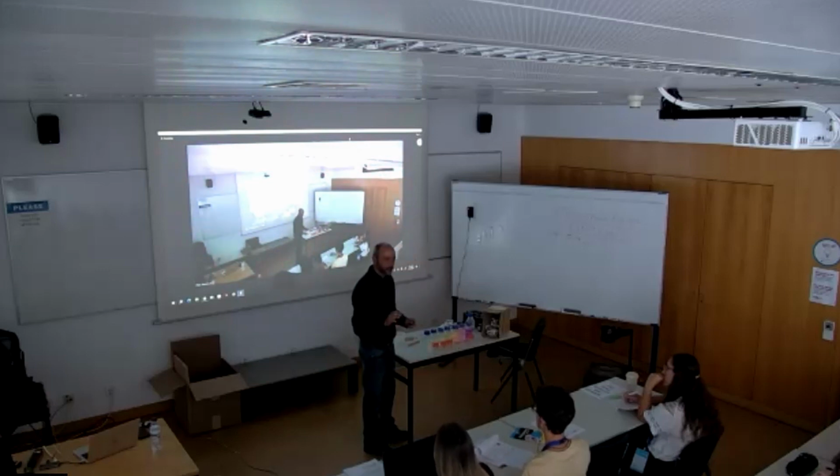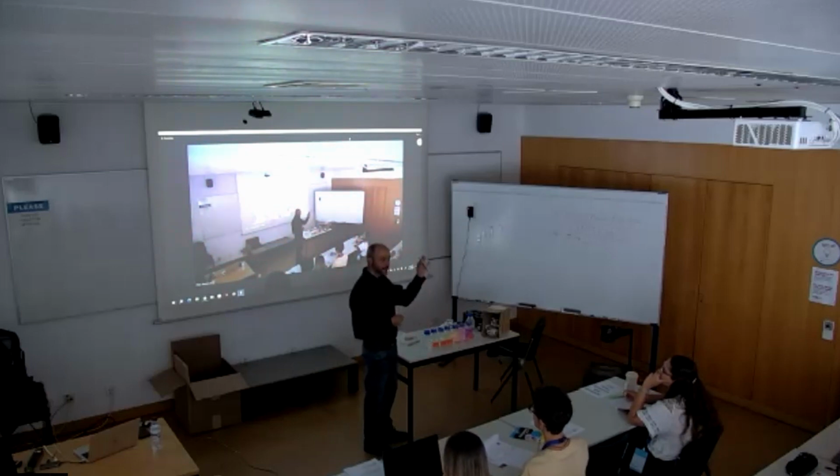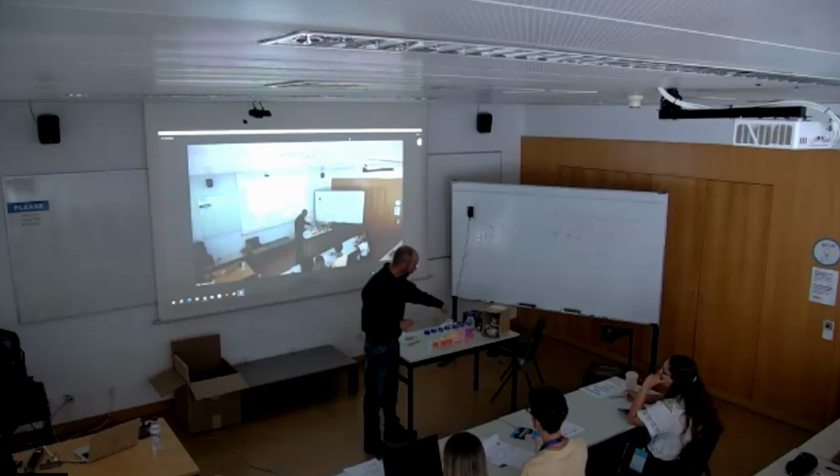But exciting an electron, like the electrons of a fluorophore, is like buying anything in a shop. If you go with the right amount of money, you will get what you want. If you go with less money, you will not get what you want. But if you go with more money, you will get what you want, the difference is that then you will not get the rest from the fluorophore, okay? Since this is highly energetic, near UV light, all the fluorophores that require less energy will be excited and be happy to take the energy and then produce the fluorescence.